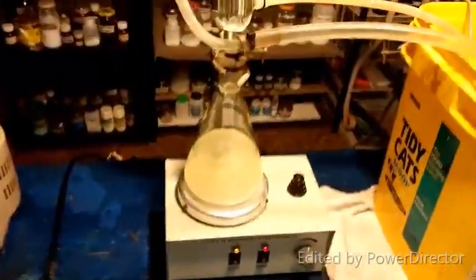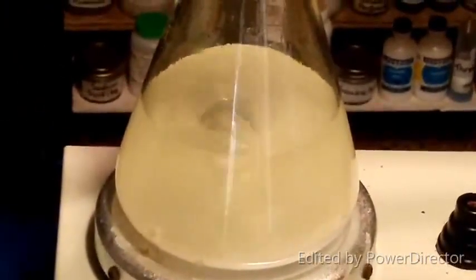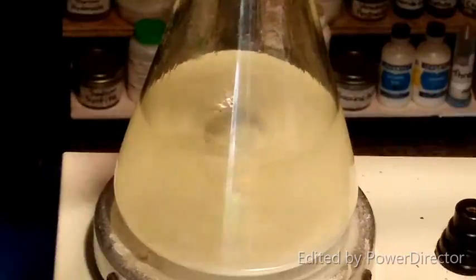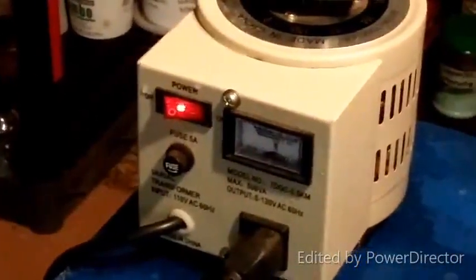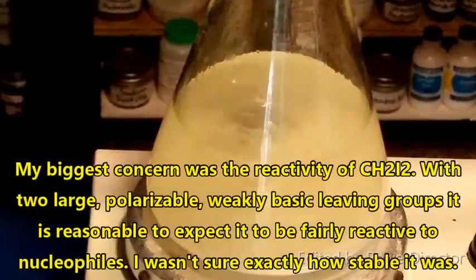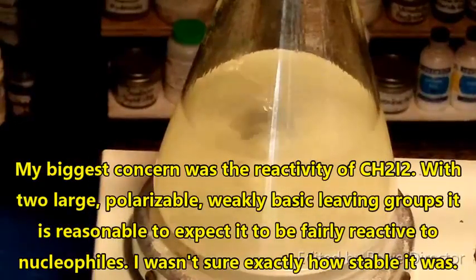Give you guys a closer look here. There really isn't much to see. I have got it on full power right now just to try to dissolve as much of the sodium iodide as possible. The heat is on. Once it's dissolved and everything is refluxing and everything is happy, I will use the voltage regulator over here to turn down the power a little bit so that it doesn't heat it quite so strongly. And I don't think it'll have any issue stirring once all of the sodium iodide is dissolved.